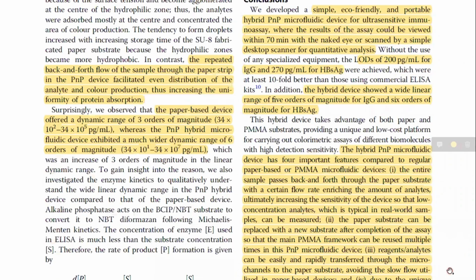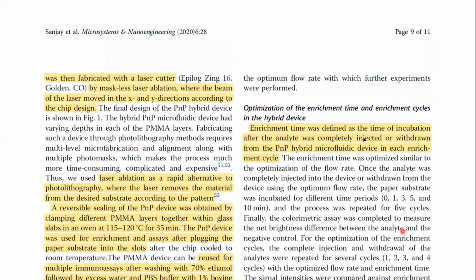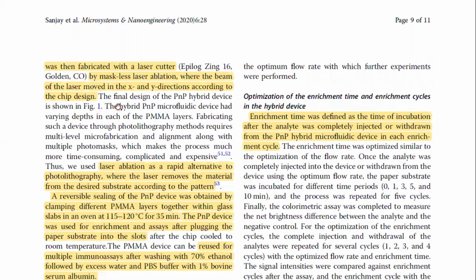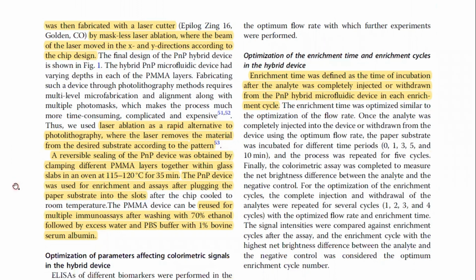As conclusions, they also show us how they fabricated the PMMA chip. The PMMA chip was fabricated, as it was mentioned before, using three layers: bottom, middle, and top layers. This chip was fabricated using the laser ablation technique, which is a rapid alternative to photolithography. This strategy consists in the removal of material from the desired substrate using a laser. Also, a reversible sealing of the plug-and-play device was obtained by clamping these three layers together within a glass slab below the bottom layer.